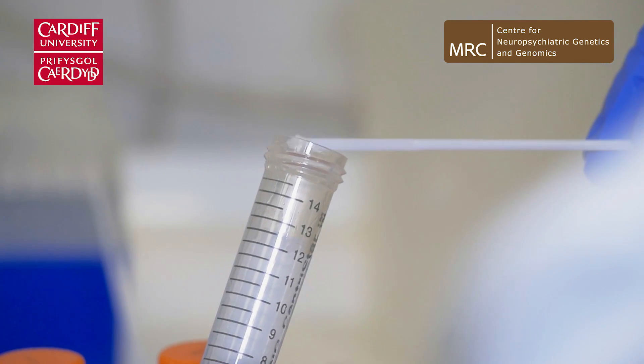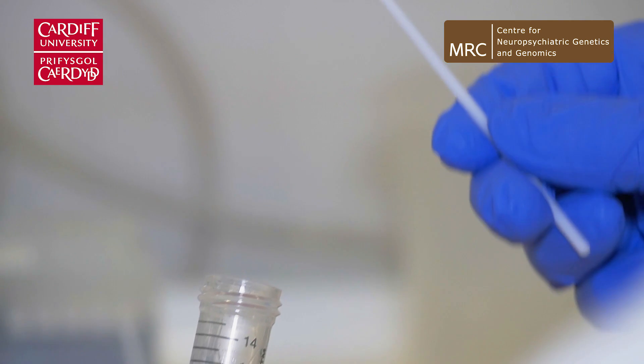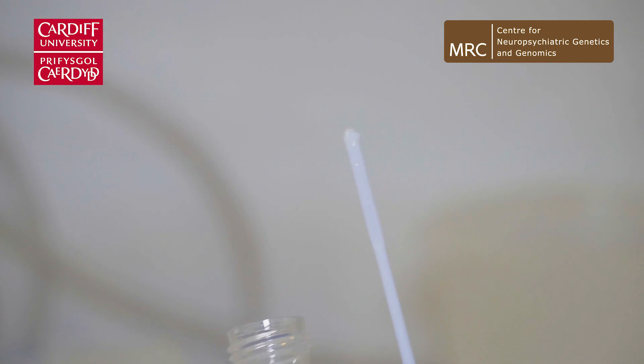I find that really quite satisfying to see it forming when you add in the ethanol, because you know that the procedure has worked correctly and you know you've got a good yield of sample to then use in the downstream applications.